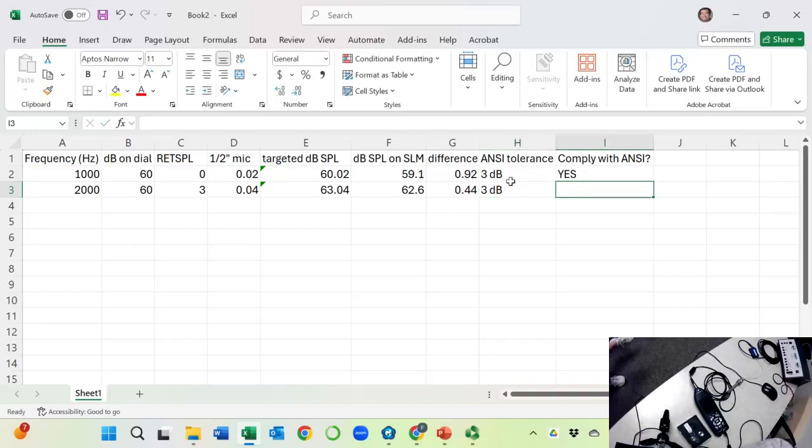Within, and this time I'm going to spell it correctly, right? And now you get the idea. You can do whatever frequency, whatever intensity, in the same manner to calibrate your instrument.